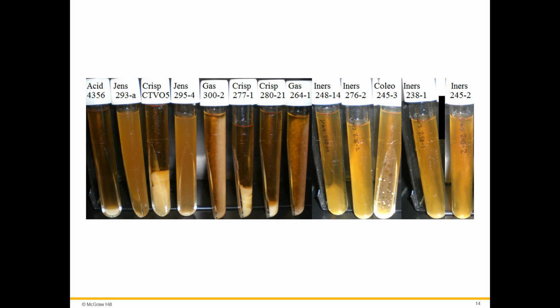So this one's a pretty tough microorganism, and you can see how it's not just forming a loose sediment, it's actually forming an aggregate, and you can see how it's kind of clustered together, and it's so tightly aggregated together. And you can see that not only in the strain that we would give as a probiotic, but also in the clinical strain. You can see that same type of pattern appearing here.